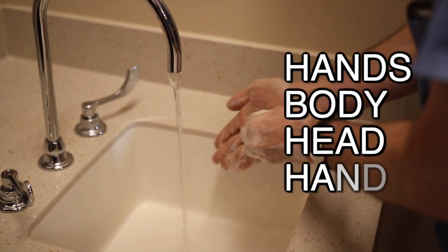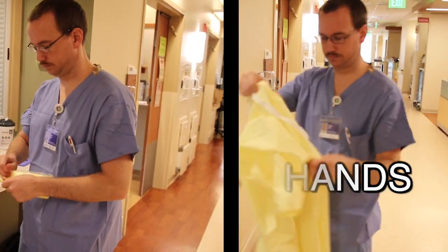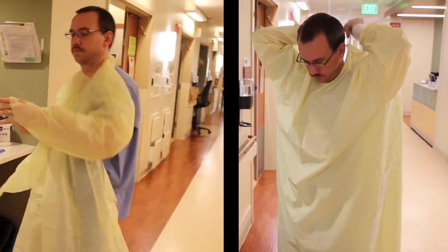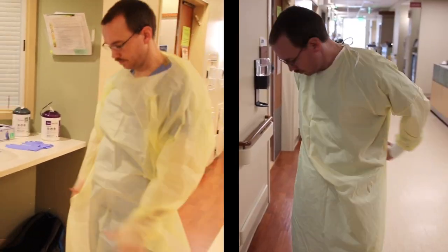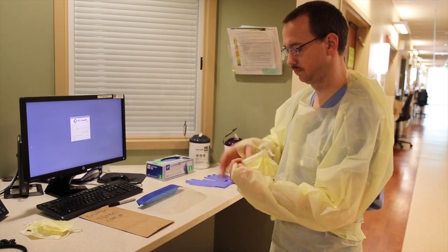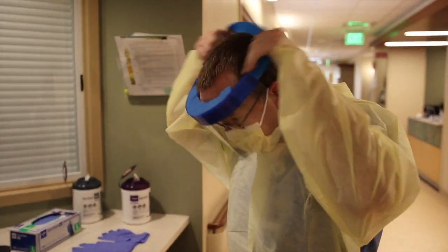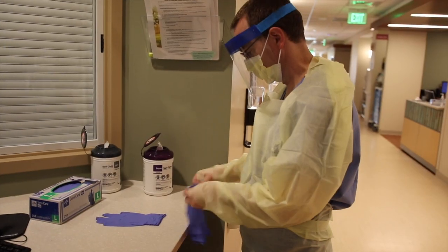We will now start our hands, body, head, hands method of putting on equipment. Start by washing your hands thoroughly. Then go to donning your gown. Again, either disposable or reusable, whichever is currently advised by your hospital administration. If you are using new masks in patient rooms, please place your new mask on at this time. Then go to placing your face shield over top of the mask. Then put on your gloves.